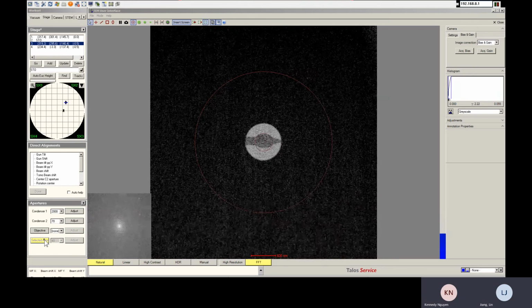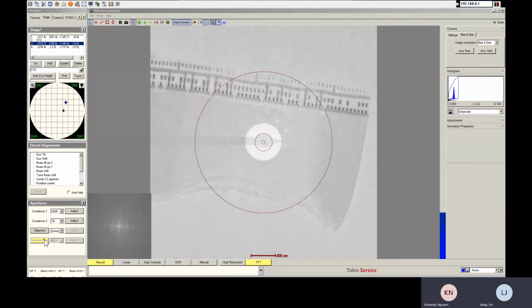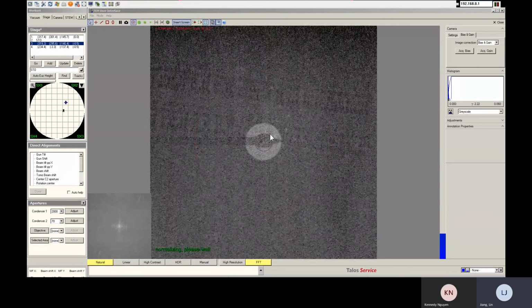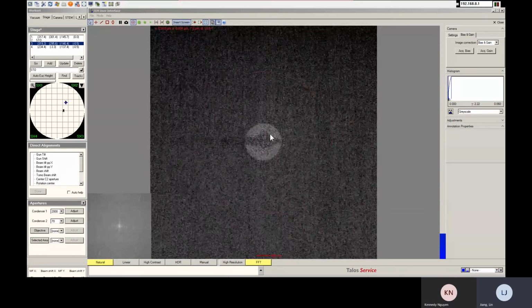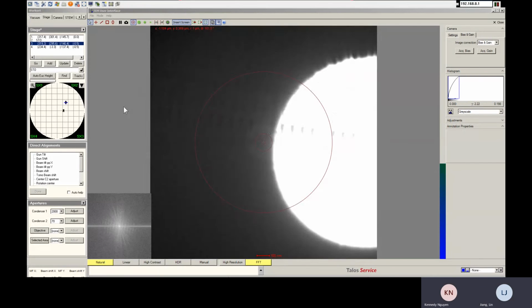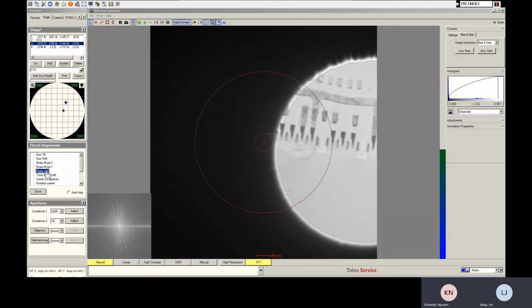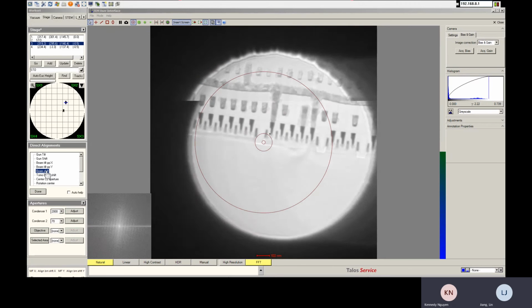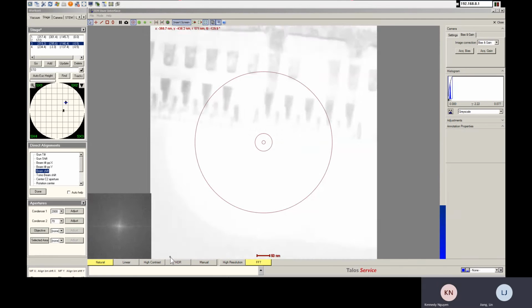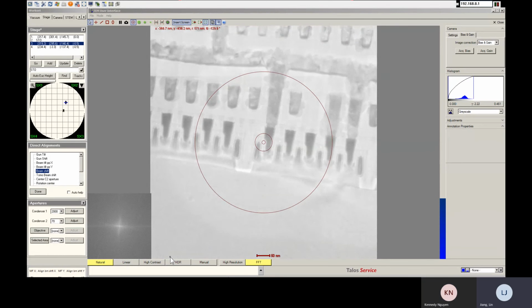And then you can move to the region change. Let's say we want to take a small region, because this way we see some defect, right?